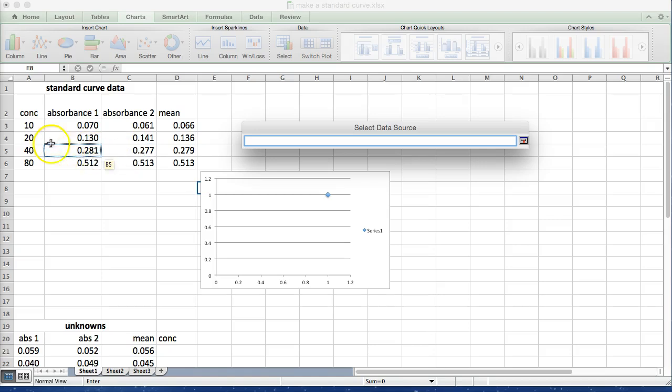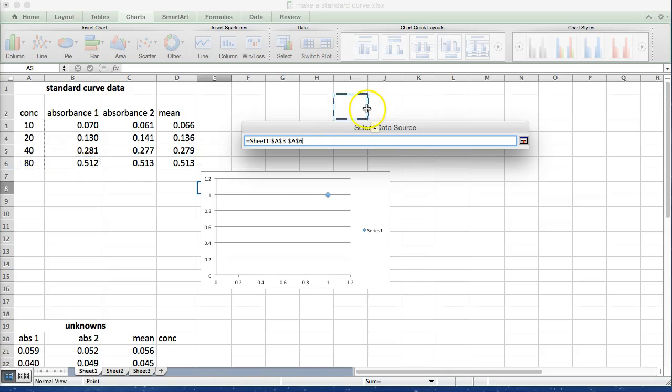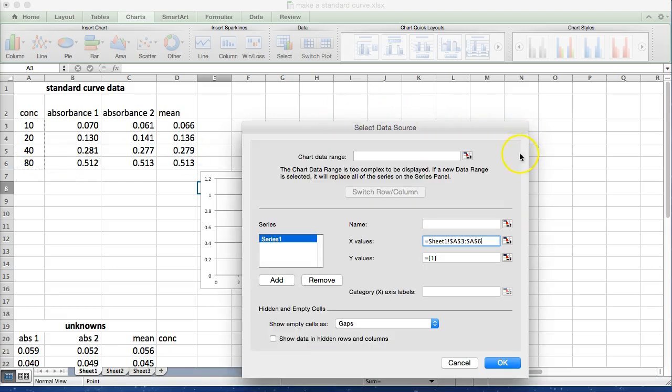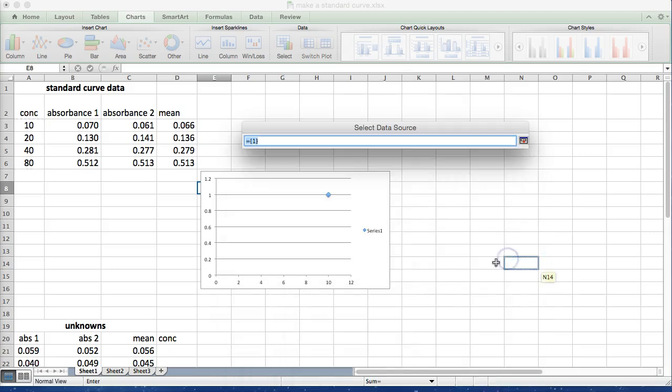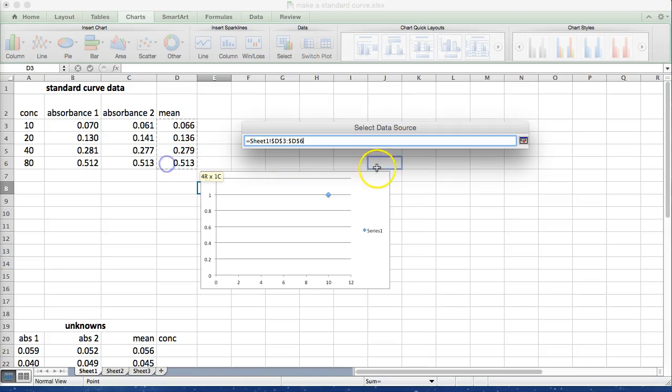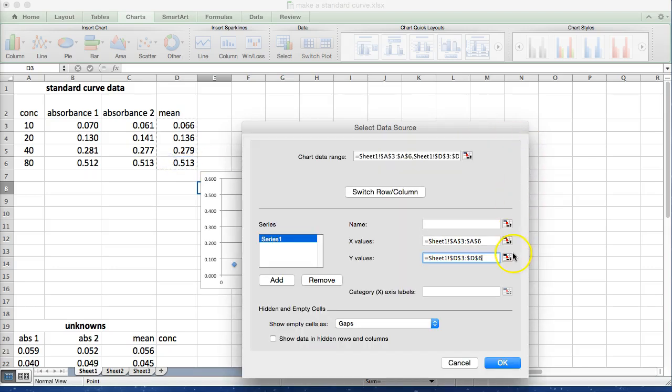So the first I'm going to do is select our X values and those are going to be our concentrations because the X has the control variable. Then we're going to select our Y values which is going to be the means that we got for absorbance.